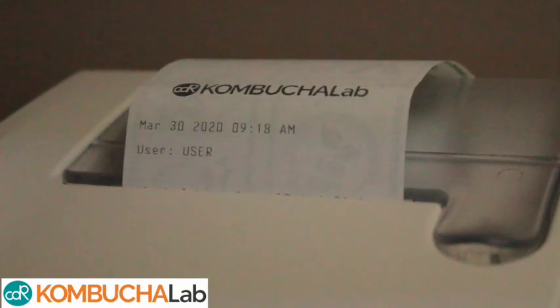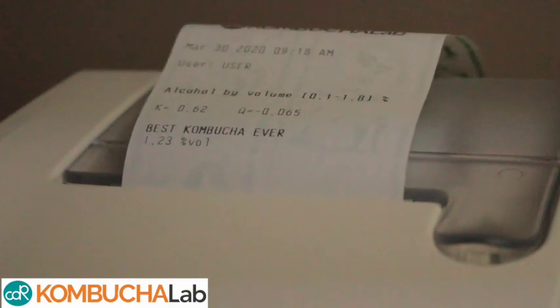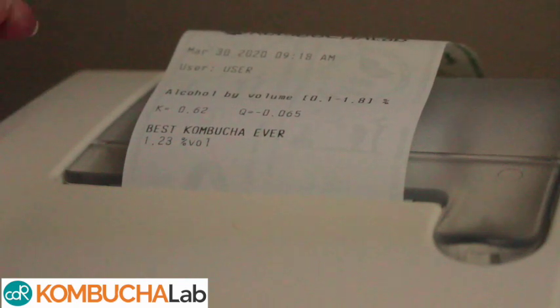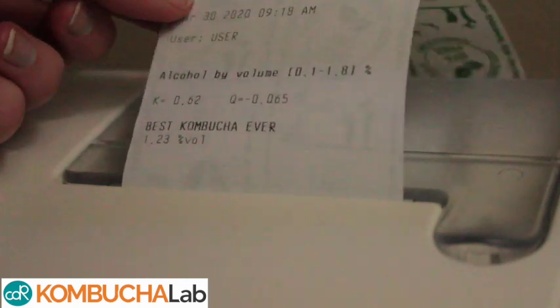And there are the results. They'll print out on your Kombucha Lab Touch, or they'll show up on the screen of your Kombucha Lab Junior. But remember, you can always find them in the results tab.